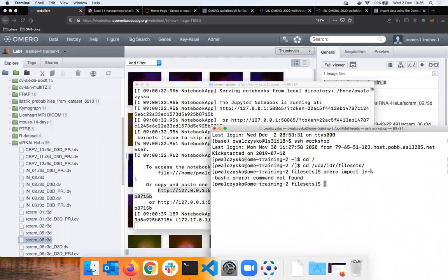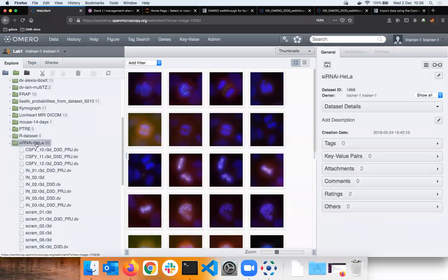But of course, you can do things here which are called scripting. You can write bash scripts, which Jean-Marie did for me, and this is already kind of automatized. The bash script is capable of importing these images because each of you has an SIRNAI folder here, okay? SIRNAI, this 50 times over. So you can see it's not out of the box, but such examples we do have. I put a link in the over bash script, the in-place import.